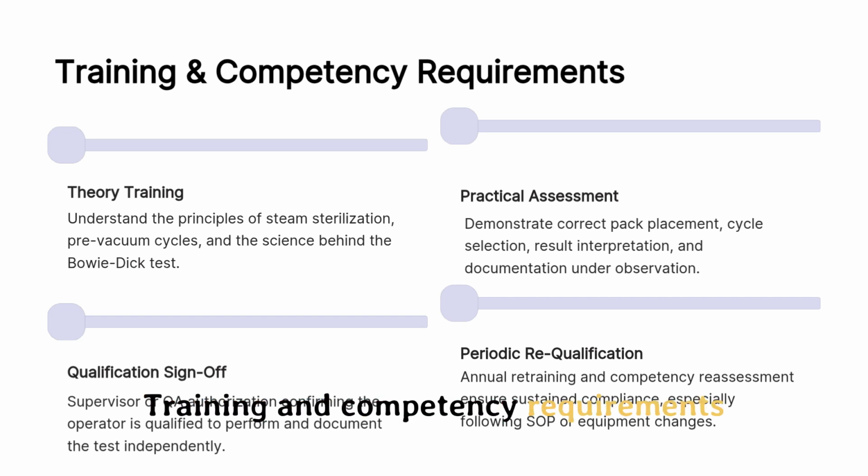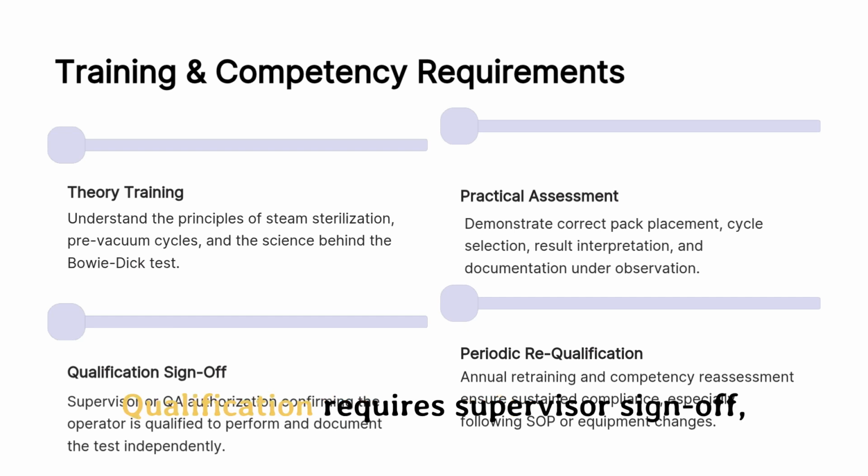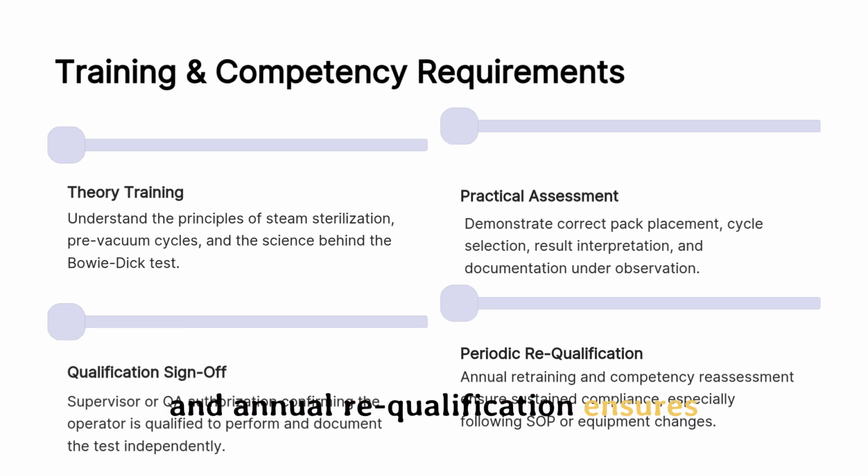Training and competency requirements include understanding steam sterilization principles and the Bowie Dick test. Practical assessments cover pack placement, cycle selection, and documentation. Qualification requires supervisor sign-off, and annual re-qualification ensures compliance, especially after standard operating procedure or equipment changes.